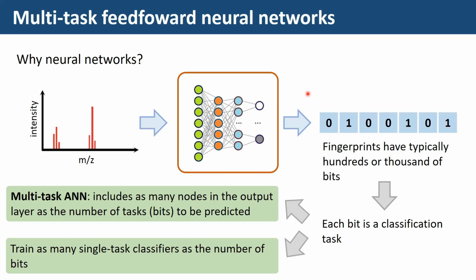I mean, the use of fingerprints is nice, because then it's easy to retrieve the molecule in the database. So then you have PubChem or whatever, and usually the fingerprint is a standard way to represent in a holistic mode the molecular structure.